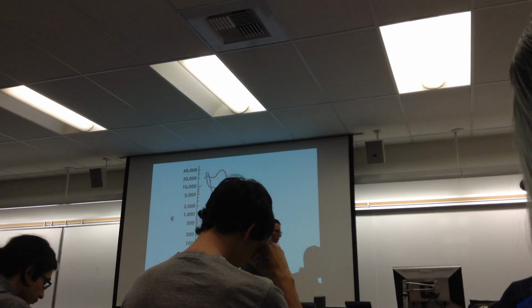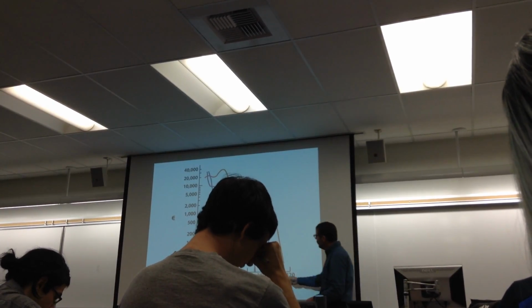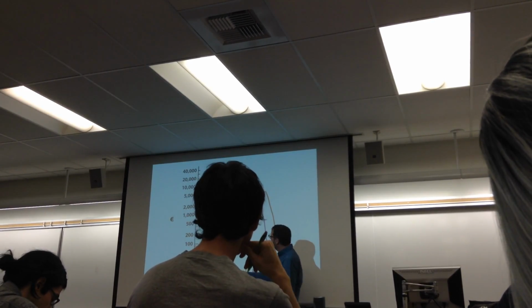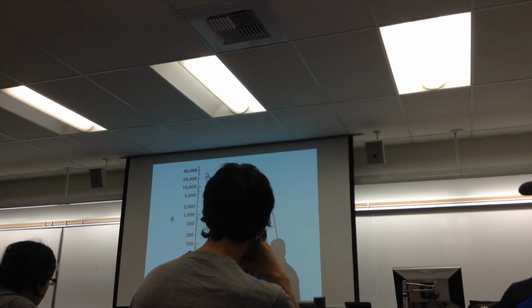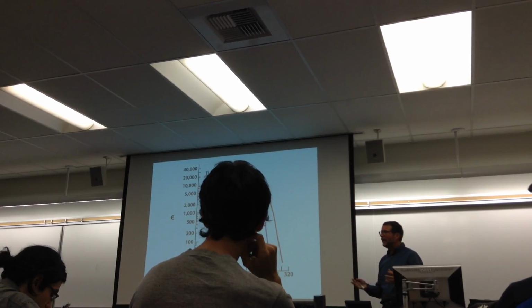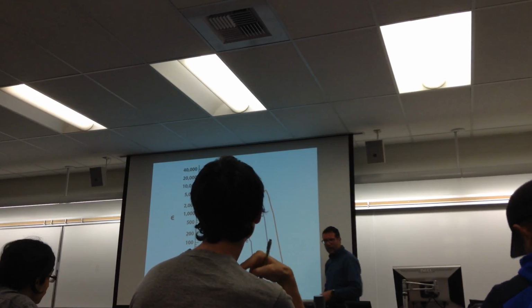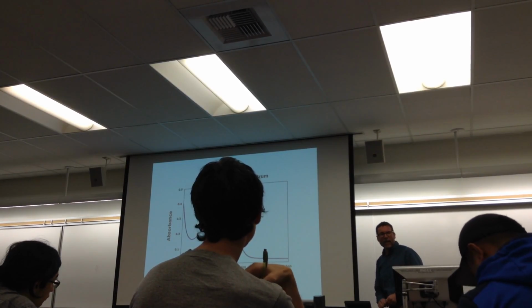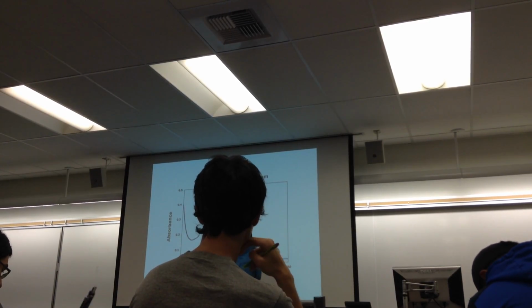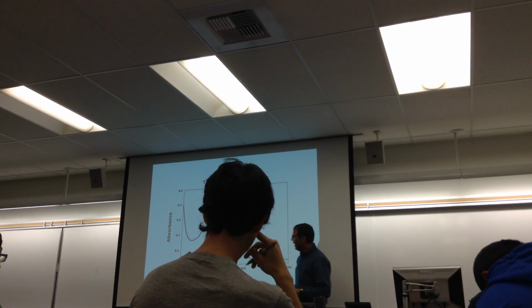And one is to take advantage of the absorbance spectra of the aromatic amino acids, particularly around this 280 nanometer region. And again, you actually have a higher absorbance down at the low values, but the reason for staying away from there is almost anything that's in your buffer or whatever absorbs down there, so it's not very specific to proteins. But 280 can be somewhat specific to proteins. And so you end up getting a typical protein UV spectrum that looks like this, with a maximum around 280 nanometers, and sometimes you'll see nice tryptophan flavor in there.